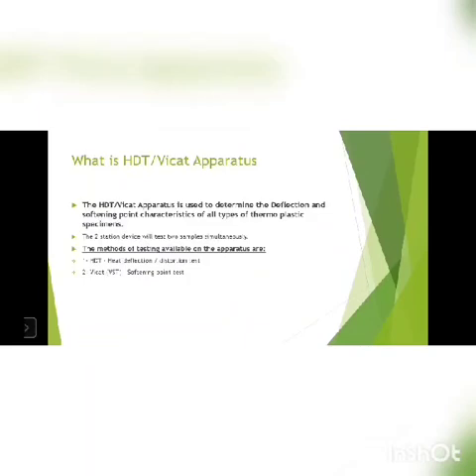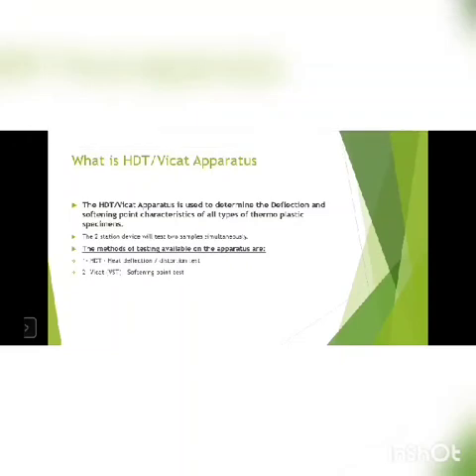Now, what is the HDT VICAT apparatus? It is used to determine the deflection and softening point characteristics of all types of thermoplastic specimens. What is the softening point? The softening point is the temperature at which a material softens beyond some arbitrary softness. At the softening point, a specific resin flows under a given load on heating.